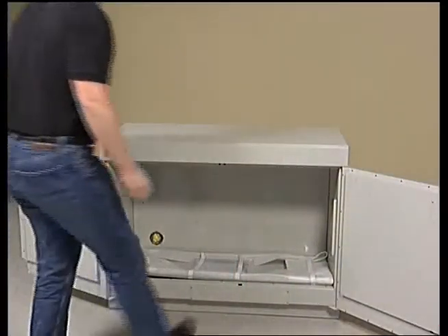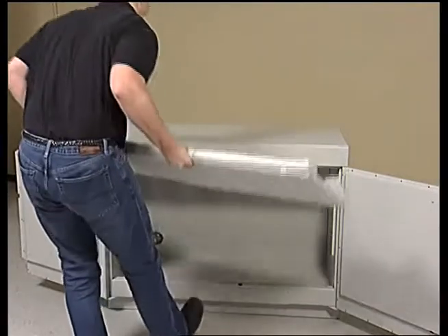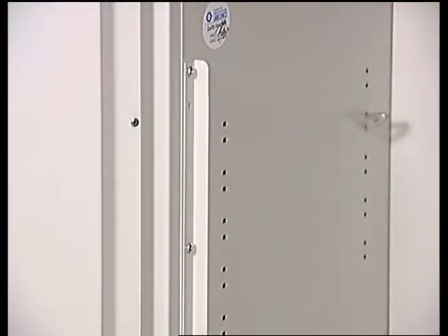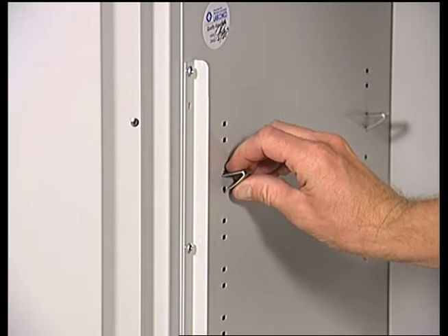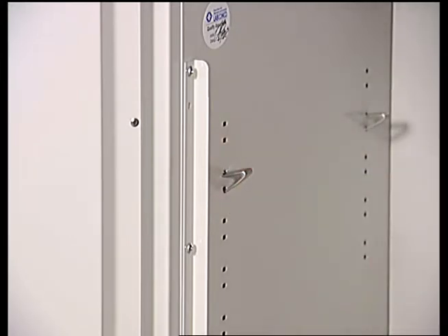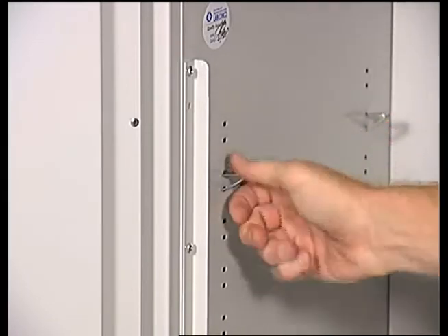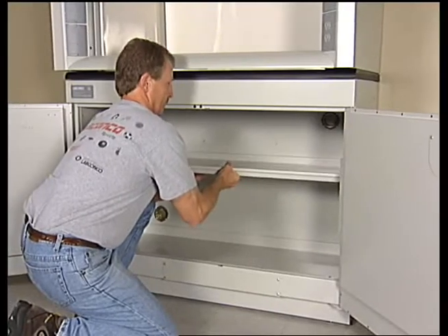Your solvent storage cabinet comes with one adjustable shelf. Locate the four shelf brackets included with the cabinet's leveling feet and place one bracket in each of four matching shelf positions located on the interior walls of the cabinet. Make sure that the shelf brackets are located at the same height to ensure that the shelf will be level. To install, simply squeeze the shelf bracket with pliers and place in the shelf positions of your cabinet. Lift the shelf over the brackets and lower into position.